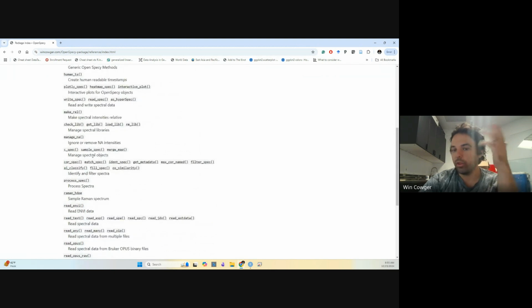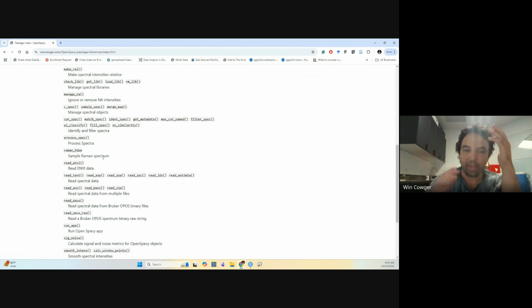Some of them aren't well documented in the examples because they're kind of niche use cases. Like one of them deals with NA values in your objects, which is a more advanced problem that you can run into sometimes when things aren't conforming exactly, but you want them to conform pretty well.